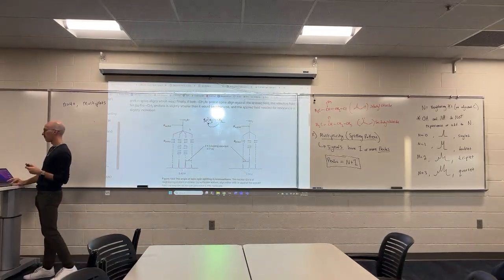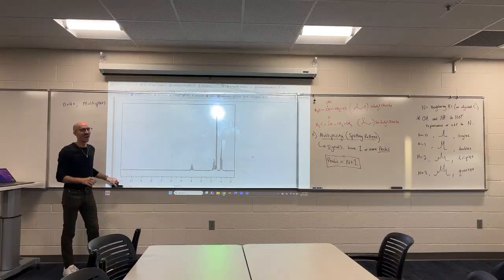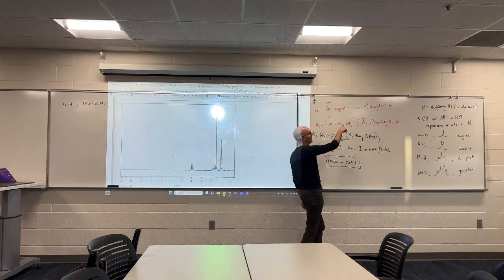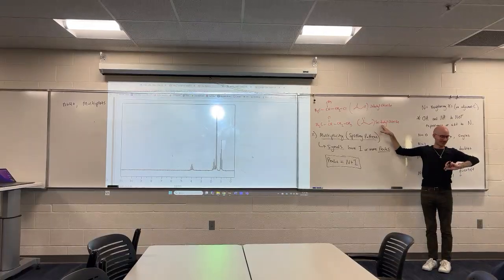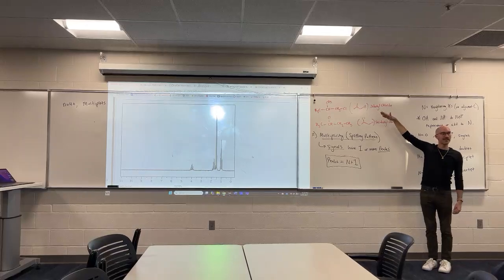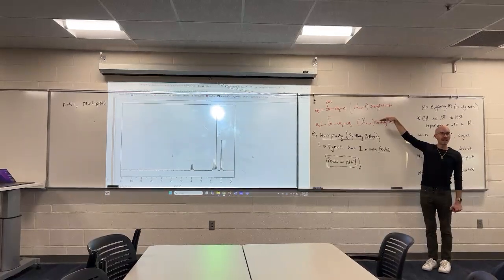So let's go back to this compound, 2-chlorobutane. Oh, no, I didn't say that. Isobutyl chloride, 1-chloro, 2-methylpropane, or, because we don't know yet, sec-butyl chloride, or 2-chlorobutane. We don't know which of these it is yet, because we had determined these two possible structures based on integration alone. We hadn't considered splitting patterns. Would these have different splitting patterns?